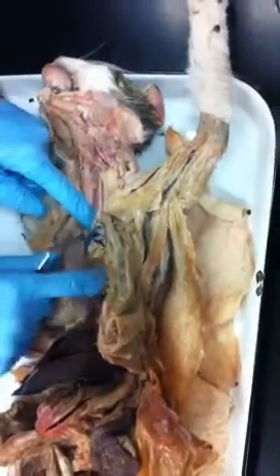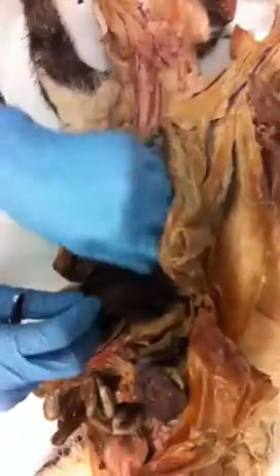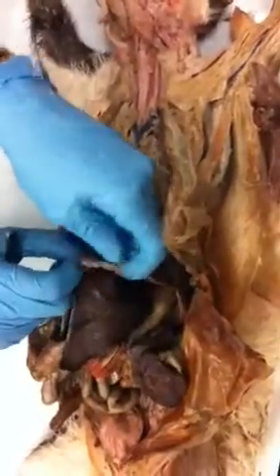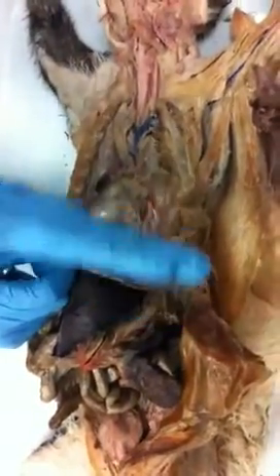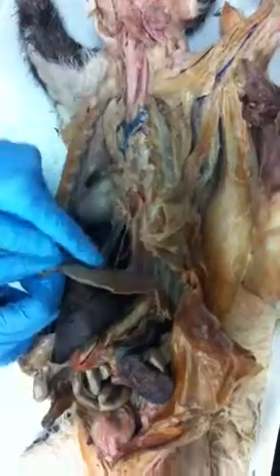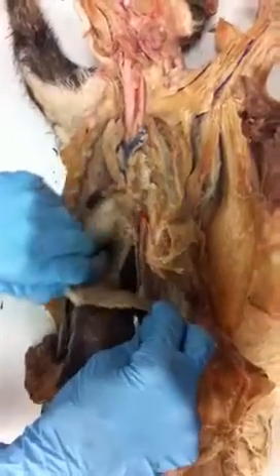The esophagus comes all the way down, and eventually it has to end at the stomach. To get to the stomach, we have to first go through the diaphragm. The diaphragm seals off the chest from the abdomen. Okay, this is the diaphragm. It's a long sheet of muscle.